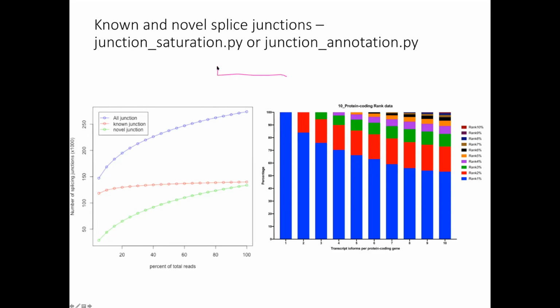You have 2 genes like this, and the part over here is the same. So when you map a read here, it's also going to map here. But in this other part, they are unique, so if you map a read here, it won't be mapped over here.